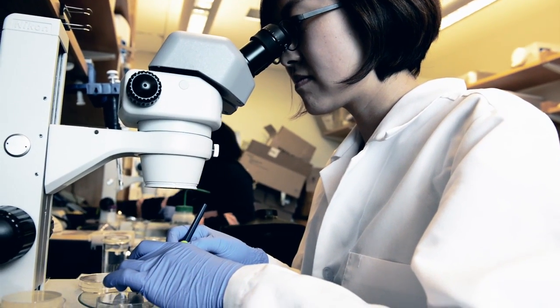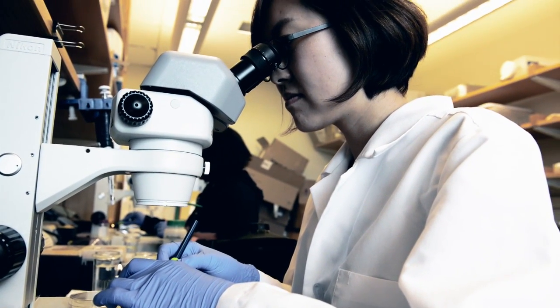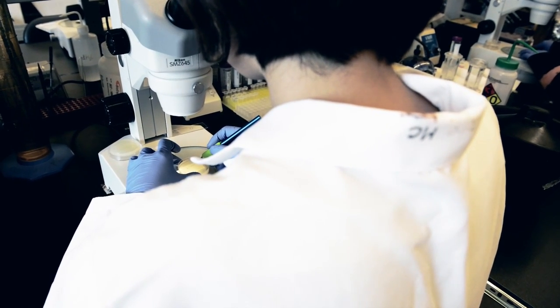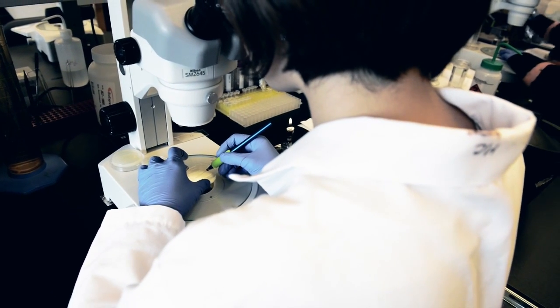The traditional way of doing lifespan experiments is that you sit down in front of a microscope, and you have a population of 100 to 200 animals. Every day, you go through each individual and sort of poke it with a little rod — if it moves, it's still alive. And it works great, you get the experiments done, but it doesn't really scale up that well.